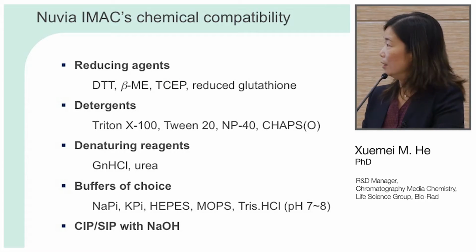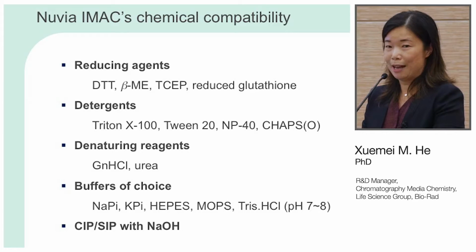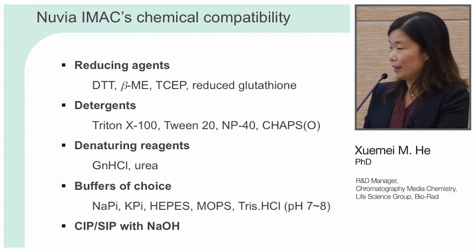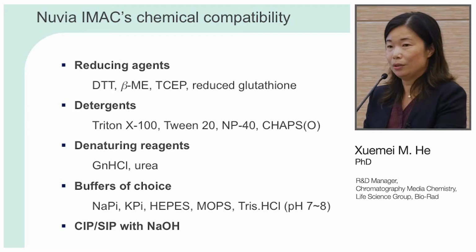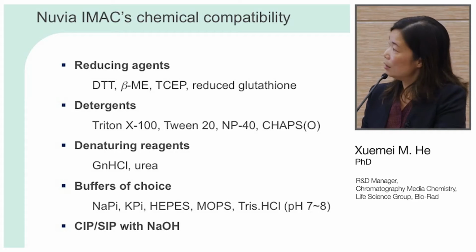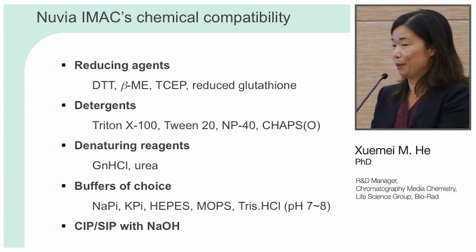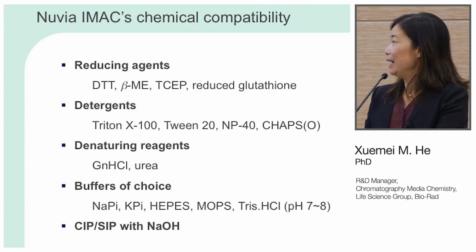Now these are some of the chemicals we've tested for IMAC purification. Basically, you can use most of the common reducing agents you may need for keeping the protein functional. I also list some of the detergents we often use in production, not that nasty.